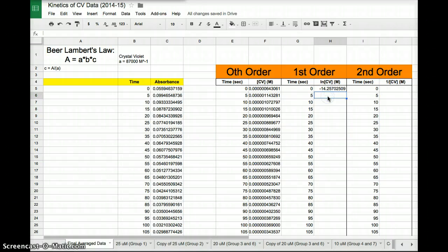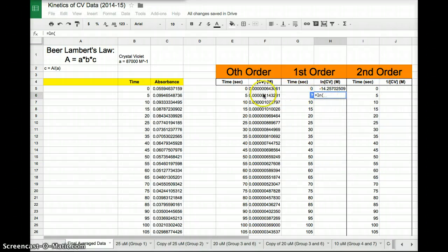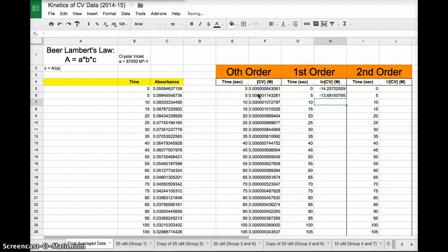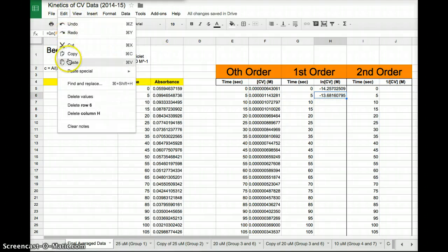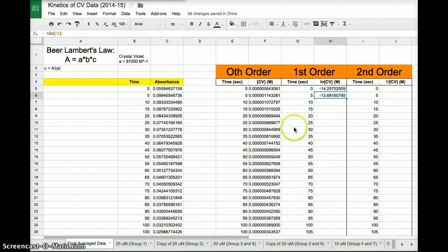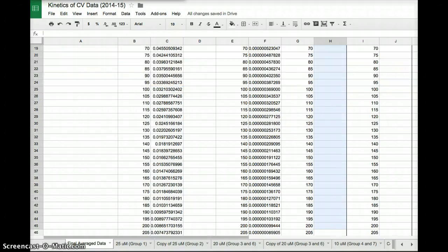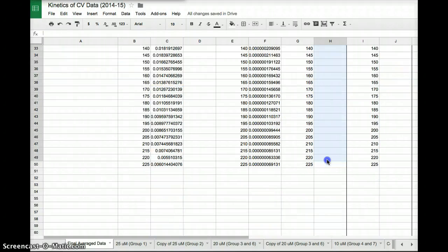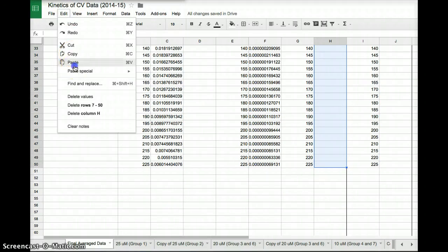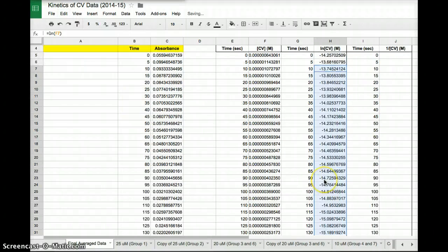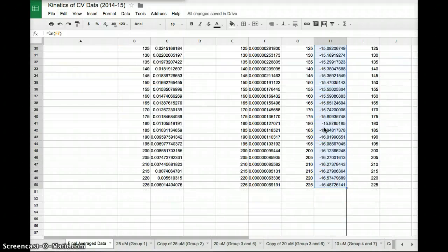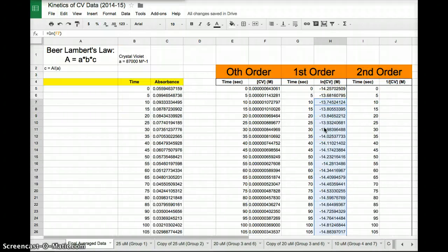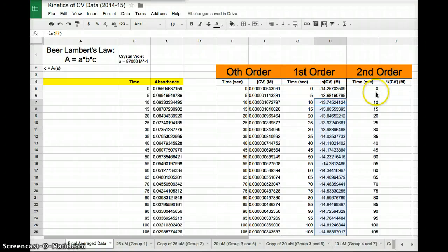Again, I could down below type the same function equals natural log parentheses of this number. Boom. Or I can just copy this function, edit copy, highlight all the data points, go edit paste. Boom. All my data is solved and converted to natural log of CV of crystal violet.